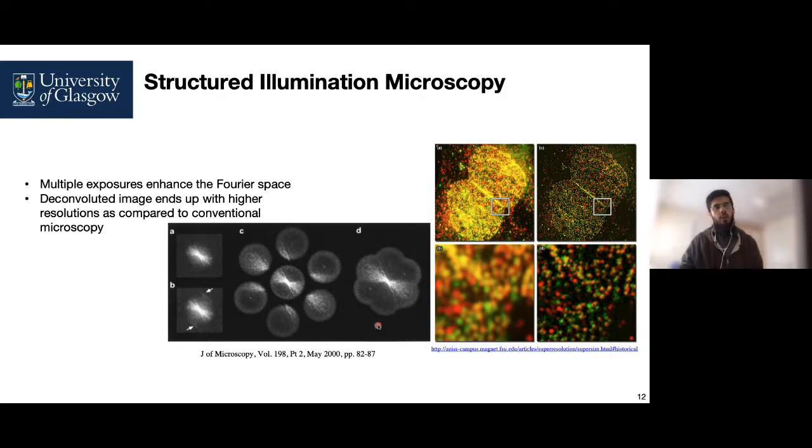As a comparison with conventional microscopic techniques, the figure on the right provides a comparison of resolution enhancement. This is a microscopic image of a biological sample.